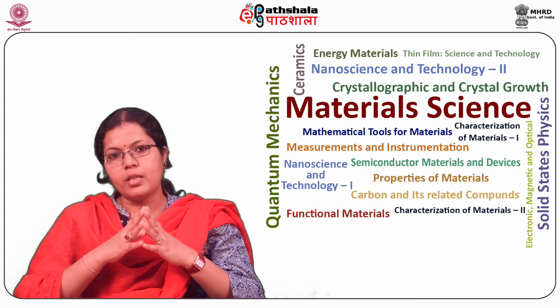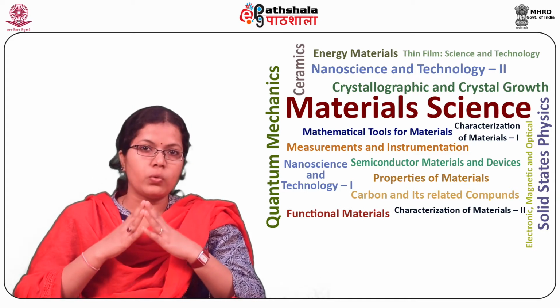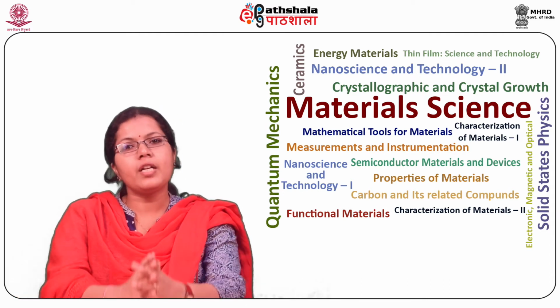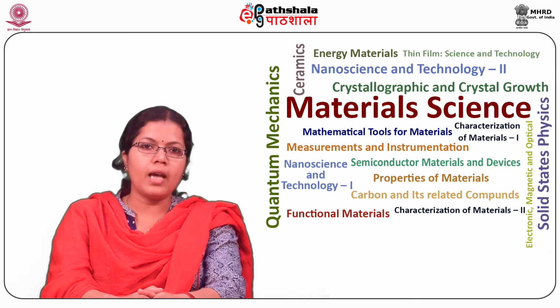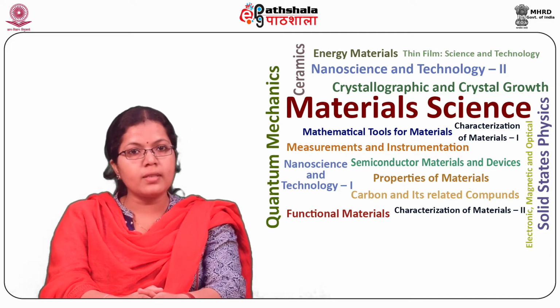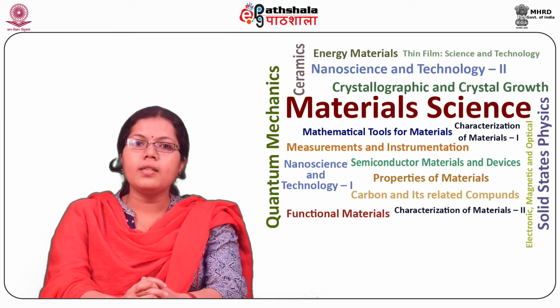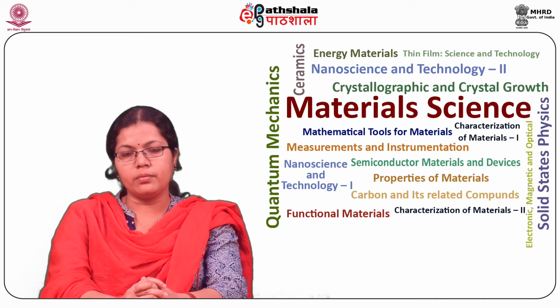A field emission tip can be cooled or thermally assisted to help overcome the work function. The temperatures are lower than those required for thermionic emission. The process requires very good vacuum. A simple tungsten tip can be very sensitive to surface contamination.